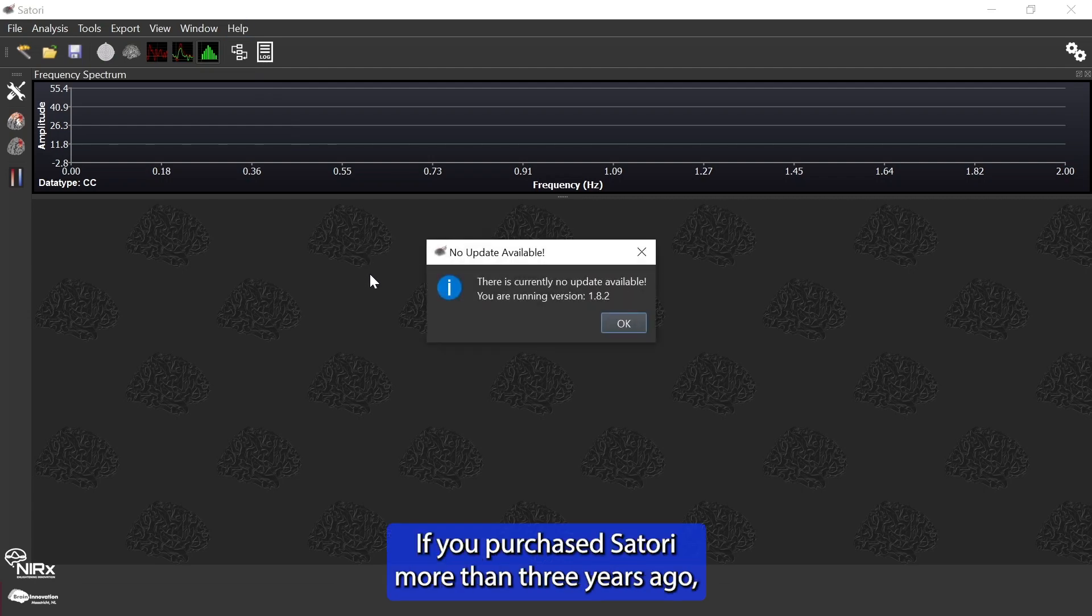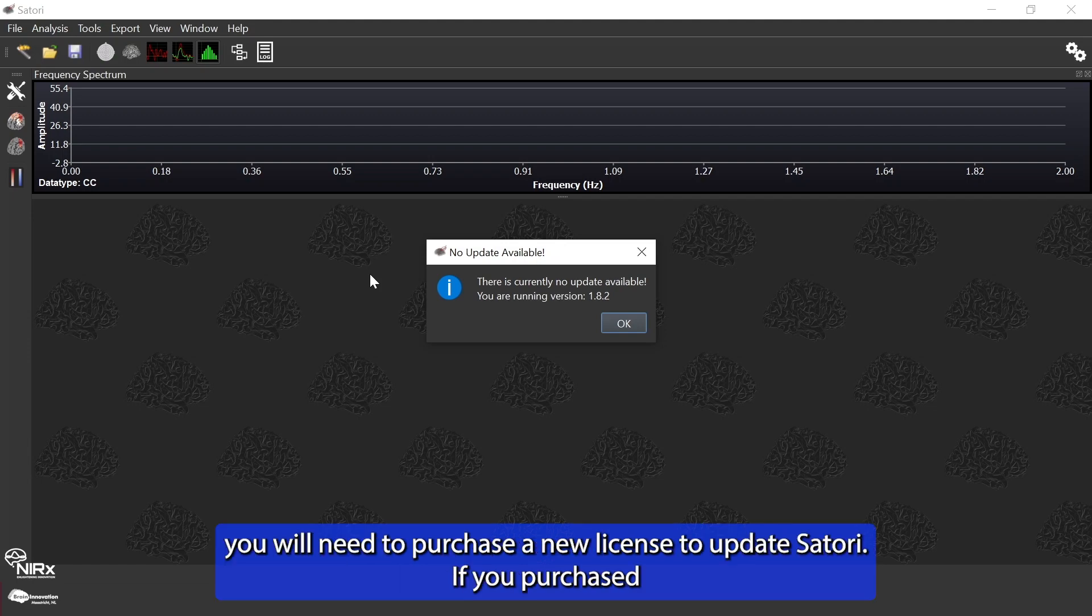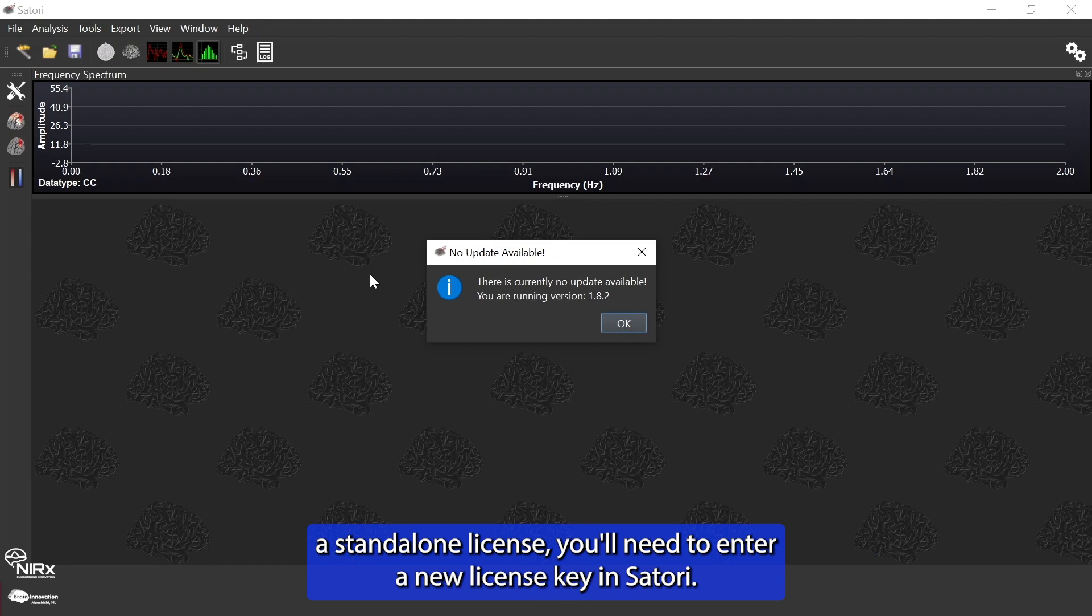If you purchased Satori more than three years ago, you will need to purchase a new license to update Satori. If you purchased a standalone license, you'll need to enter a new license key in Satori.